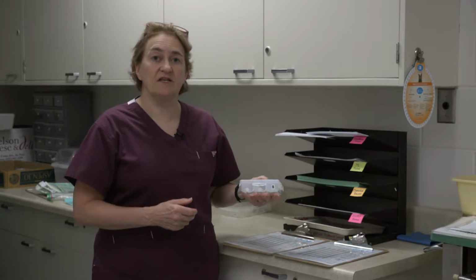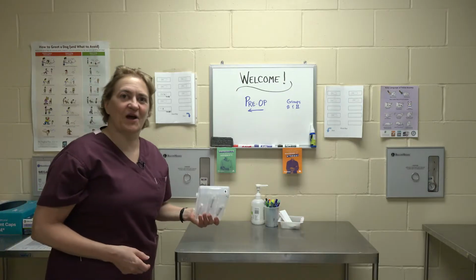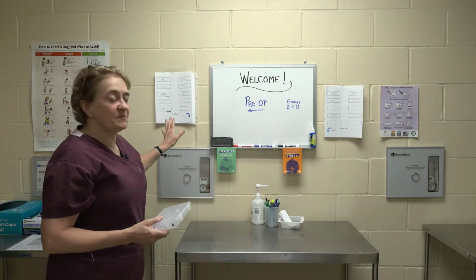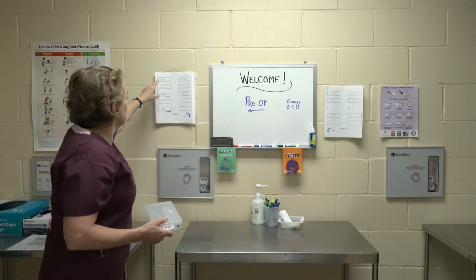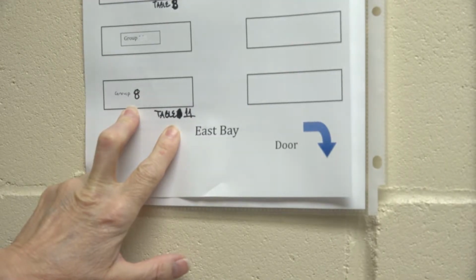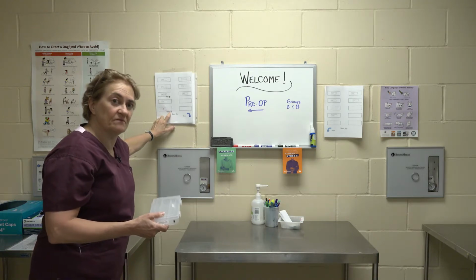Okay, now we're going to find out what table we have. Group 8, let's go find our table. Okay, here we are. I'm going to look up my table. I am group 8. Please be aware there's a west side and an east side, and the tables correspond to the tables inside the suite. So here we go, group 8, table 11. So let's go to table 11, and that's where all our supplies are for the surgery.